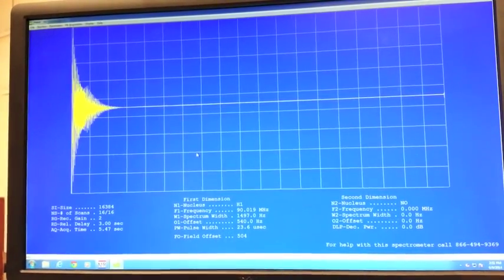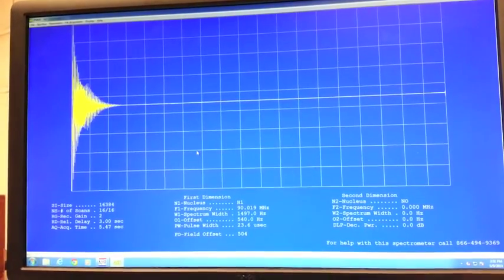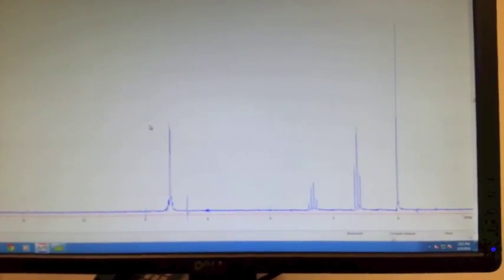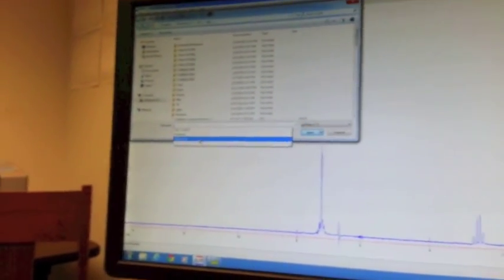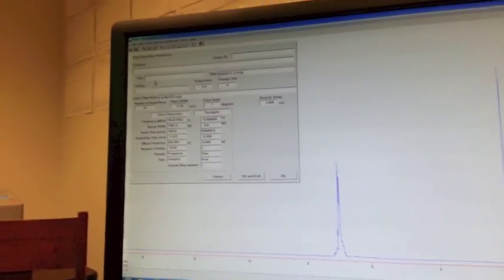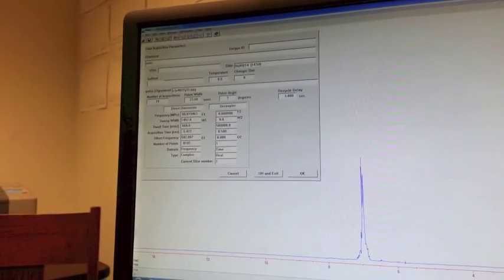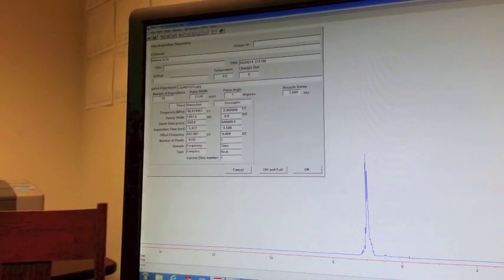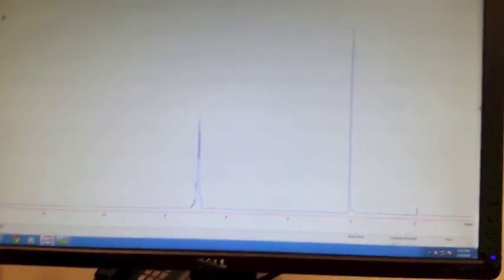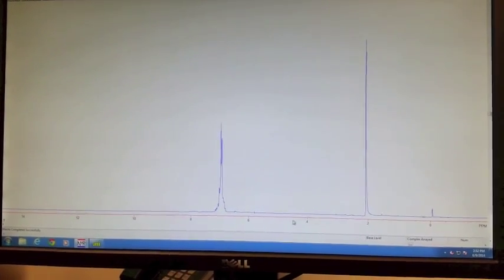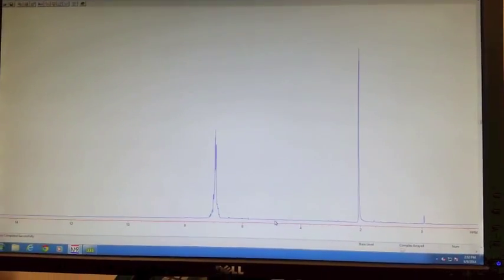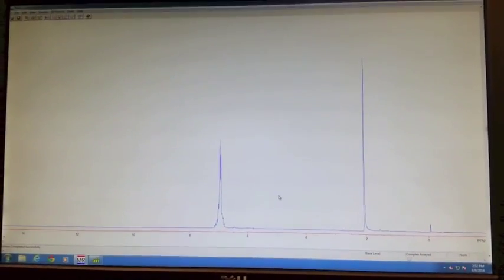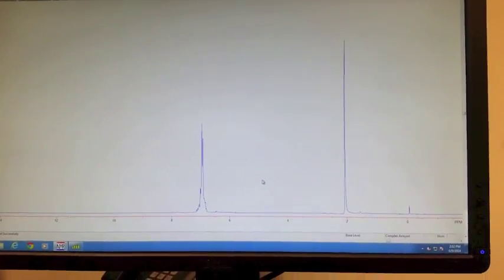Once your NMR scan is done, you can switch over to the NUTS program. This time, to open your file, you want to use Ctrl-S2. Once again, when the box pops up, you want to type in what it is and what solvent it's in and your initials. This is what an HNMR spectrum looks like. It's a little bit different than a C13 NMR. It doesn't automatically pick the peaks for you, and there are several other steps that you have to go through before you can actually print out your final spectrum.